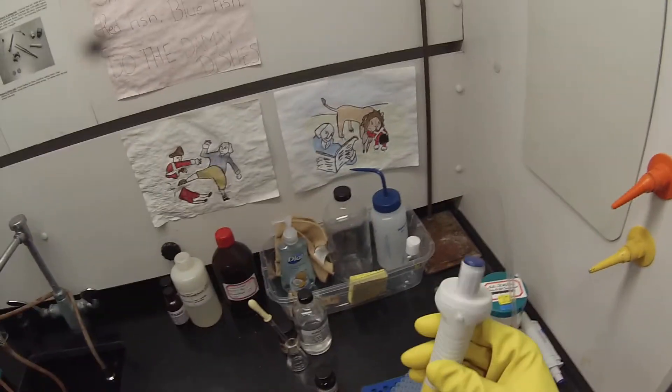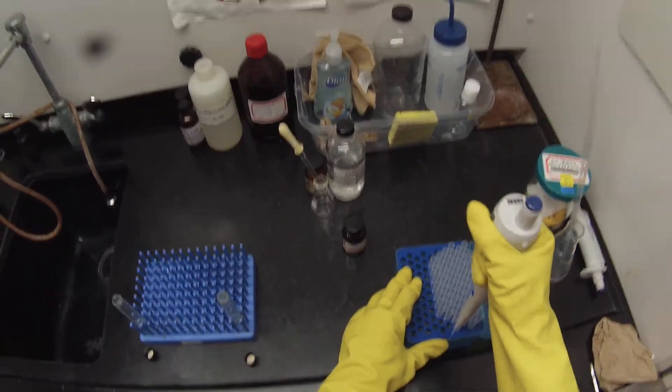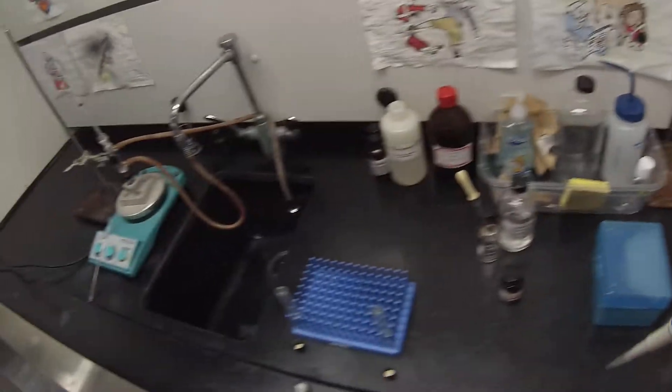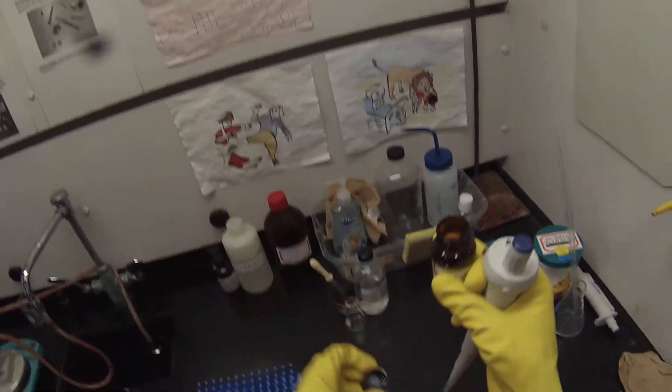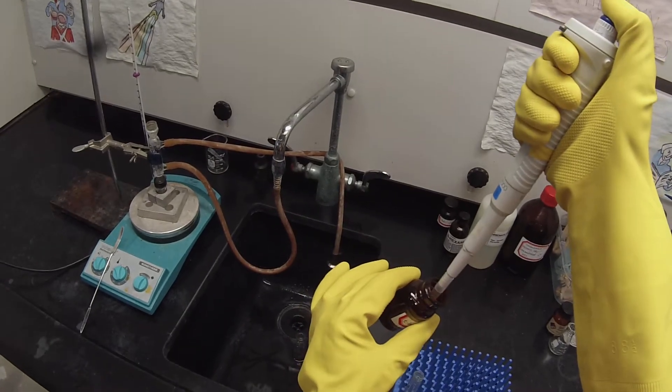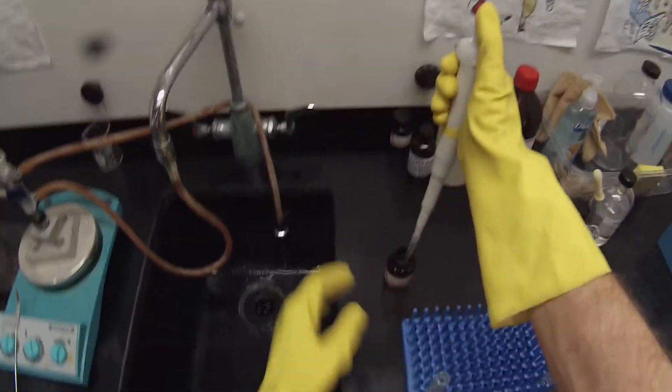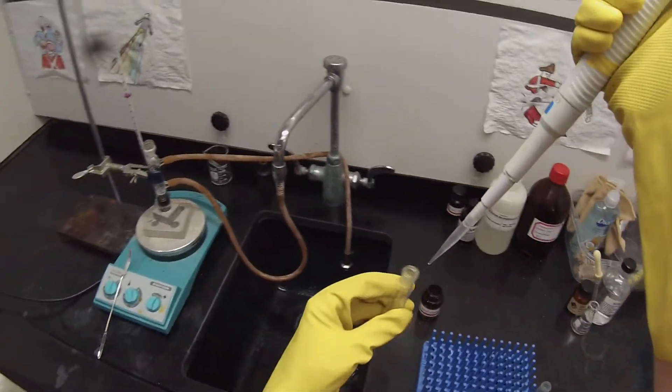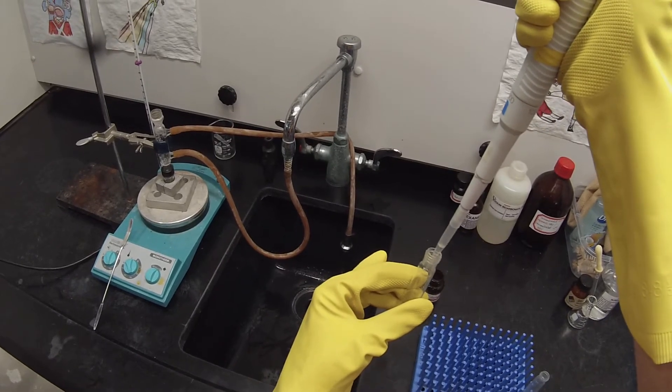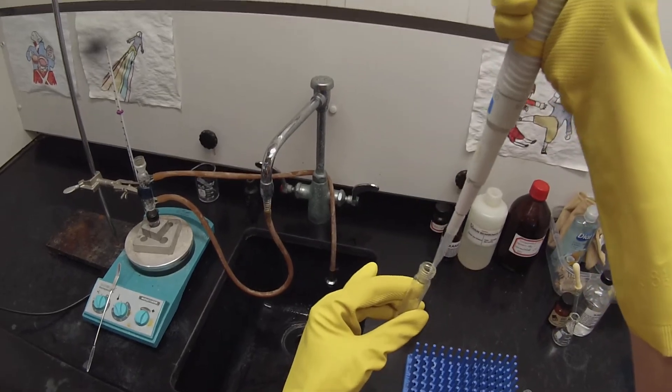So I have my pipetter, which is set at 950 microliters. And my t-butanol, which hopefully will not solidify in the pipetter. Sometimes it does. So I'm going to take 950 microliters of t-butanol. And stick it in the centrifuge tube. And this one I'm going to allow to, and then down to the second one. This is the one that I'm going to allow to react for way too long.